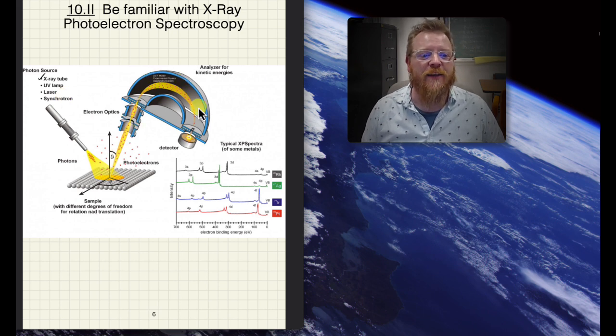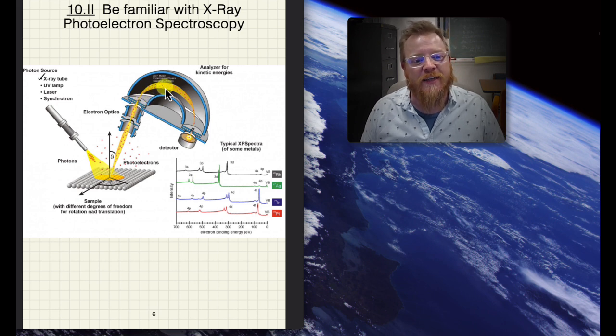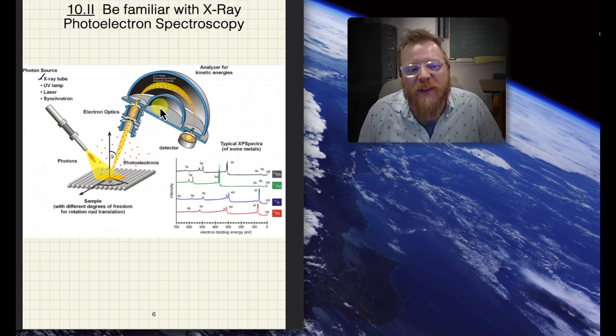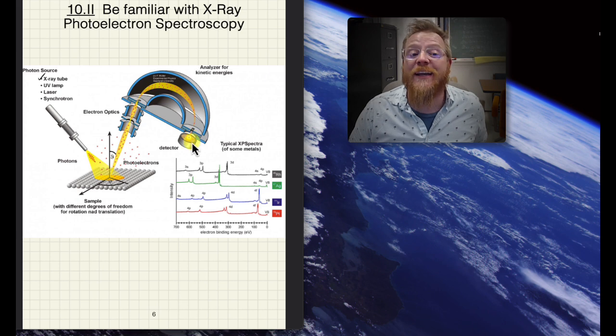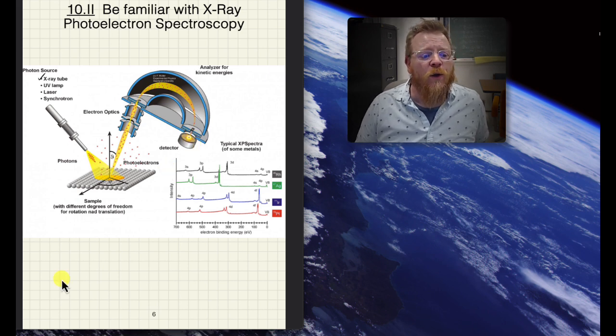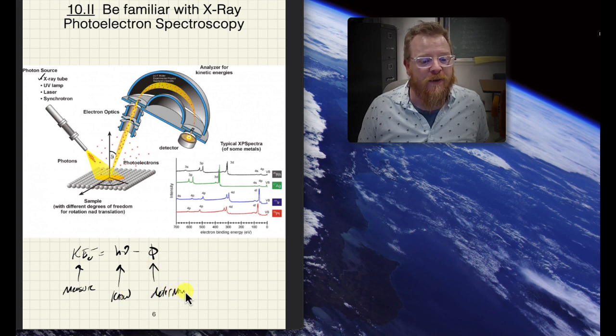So our hemispherical energy analyzer, that big dome-looking thing, operates much like a mass spectrometer. There is a magnetic field in here that will allow electrons to take this curved path, and depending on the time or the curvature that these electrons take, that will allow us to measure their kinetic energy. Recall, we're taking advantage here of the photoelectric effect, which says kinetic energy equals h nu, the energy of incident radiation, minus phi, our binding energy. So we measure this, we know this, and thus the binding energy is determined.